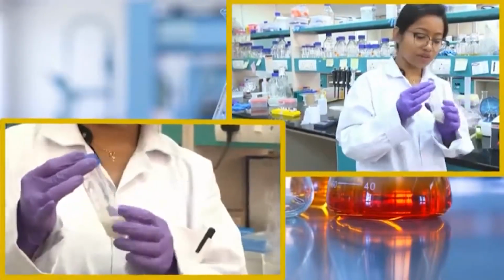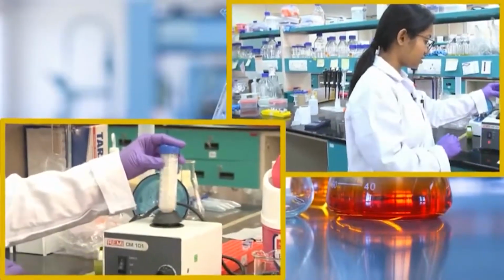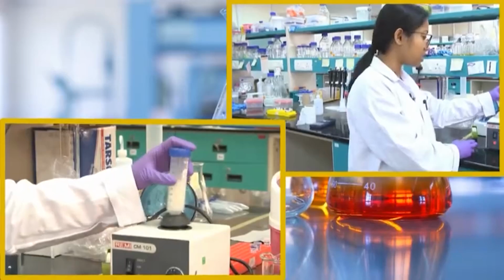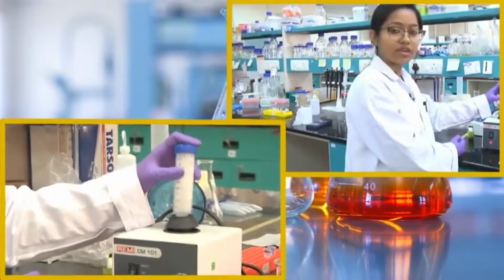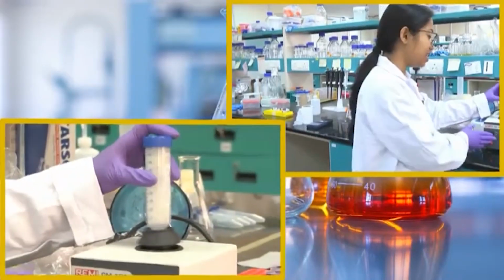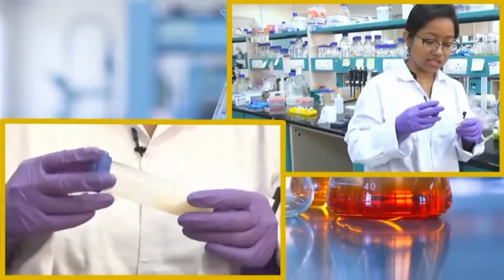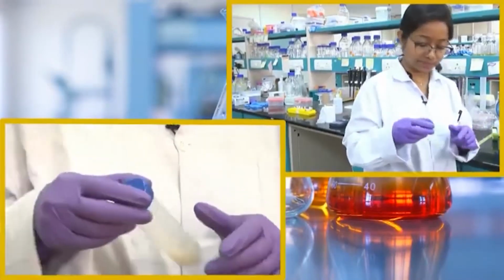Now, as it is a powder, you need to mix it up properly. So, again we will use this vortex. Vortex will ensure that the lysozyme or anything you provide is mixed up properly, and we are going a little bit harsh because now it is only intact cells, and we need to lyse the cells. But if otherwise specified, suppose you are using a particular protein or tissue system which does not require harsh treatment, you should avoid that.